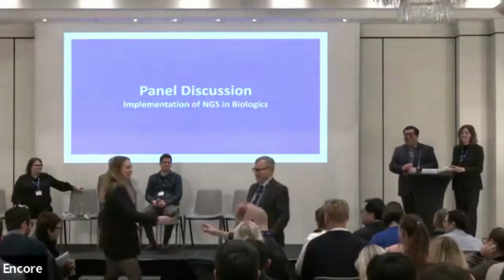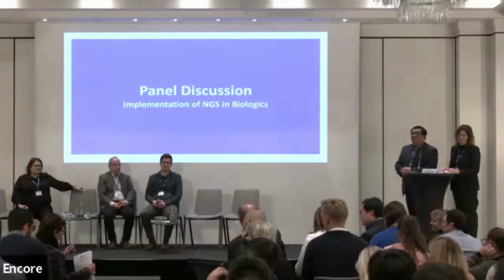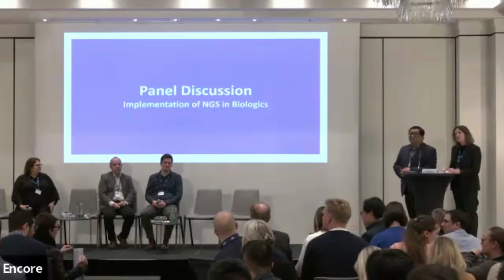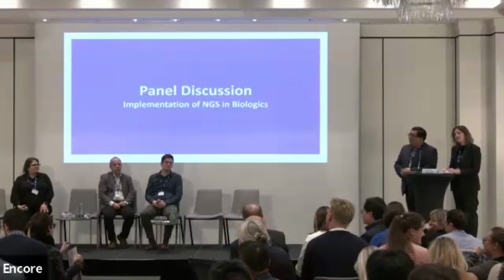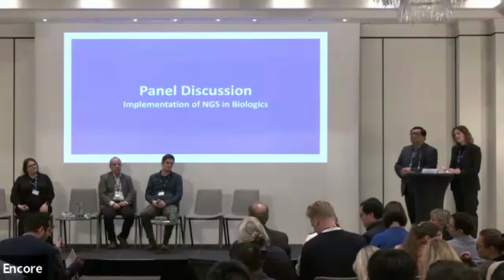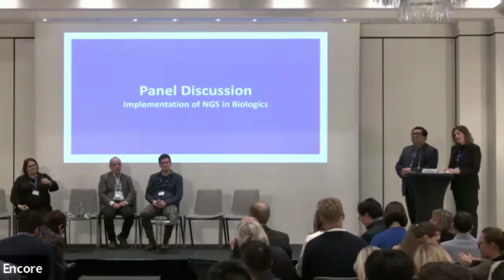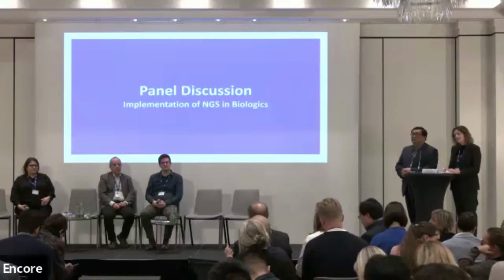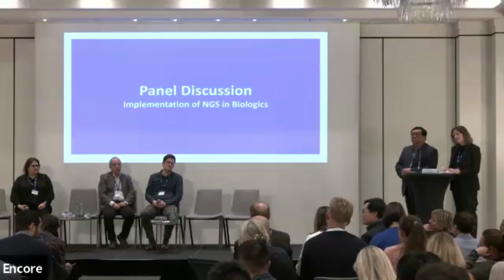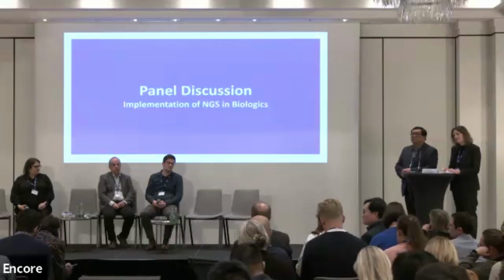We have a question. Christophe, GSK. Question for Tom. You mentioned 35 for the length of k-mers. How do you handle cases where the reference sequence is not in the database? If you have a species in your sample that is distant, like 95% identity, which is quite good already, is there a chance to miss it because the length of the k-mer is too long?